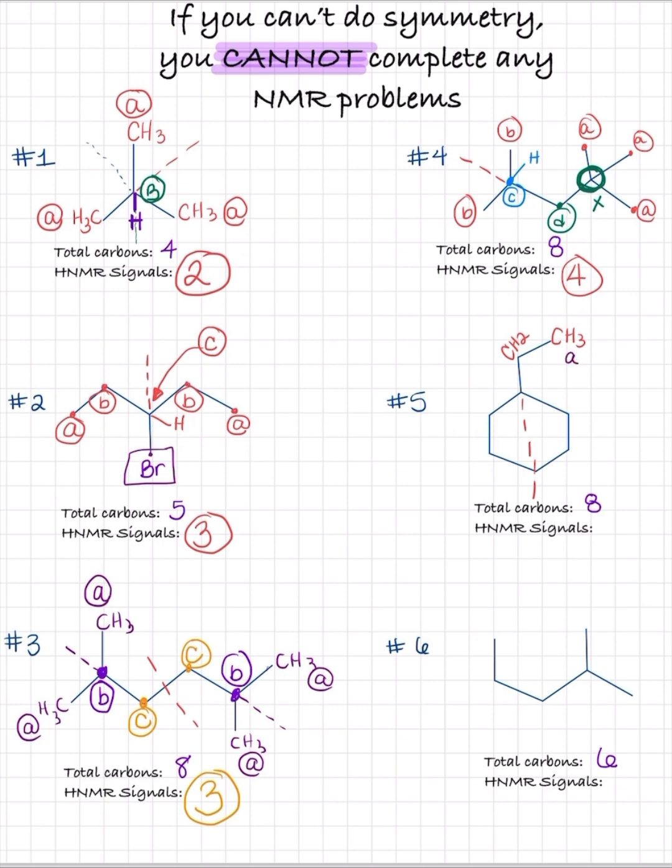So this would be labeled as A, then B. This carbon here has a hydrogen, boom, so that's C. Sorry, I like sound effects sometimes, guys. Because these fold over each other, both of these would be D. It starts to get really busy, so I don't necessarily like to label both of these as D. I'll do it for right now, but as we move into problems, you may only see me label one side because it gets cluttered, is all it is.